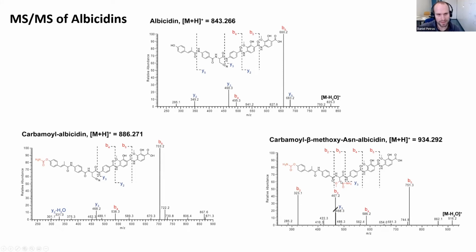So yeah, here I think MS-MS enabled us really quickly to propose those structures, because we knew albicidin already from NMR studies. And then we basically got two additional candidates, which was very exciting. And this example of comparing the spectral similarity between different experimental spectra that are acquired in the non-targeted MS-MS experiment is also the perfect example of what's happening in molecular networking.